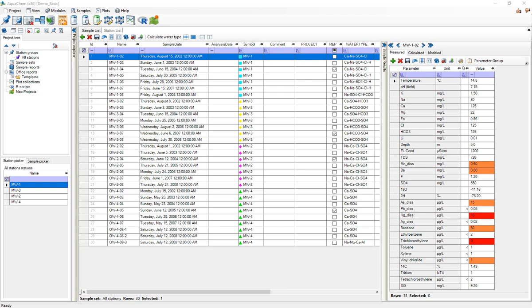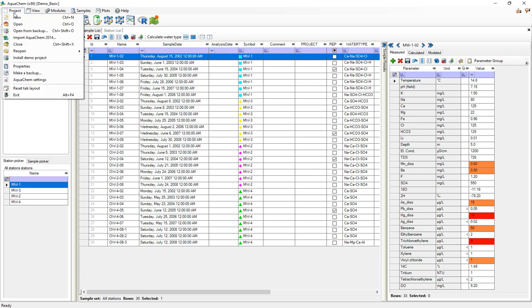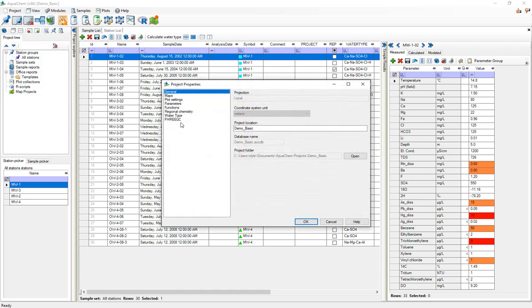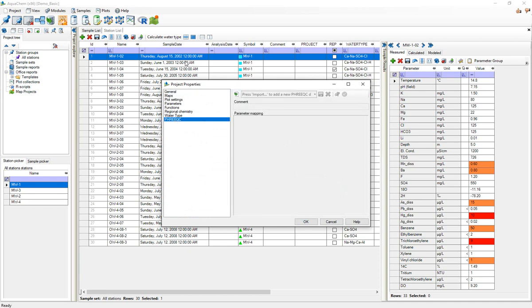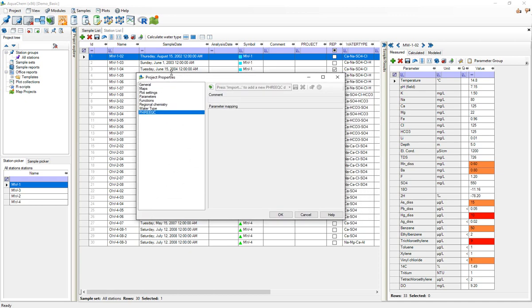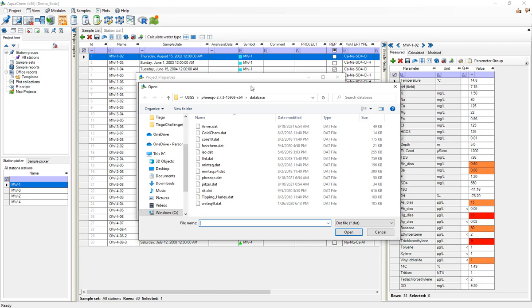To actually select a database to use with AquaChem you would press the project button right here, scroll down to properties and select the PHREEQC menu from the project properties window. As you can see we don't have any databases currently associated with this project. In order to do so we would just select this import database button.